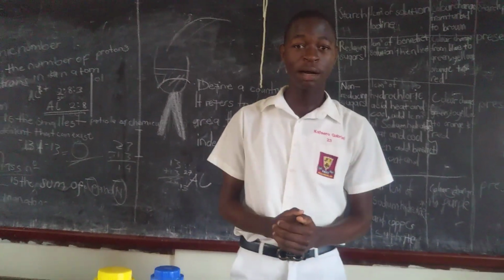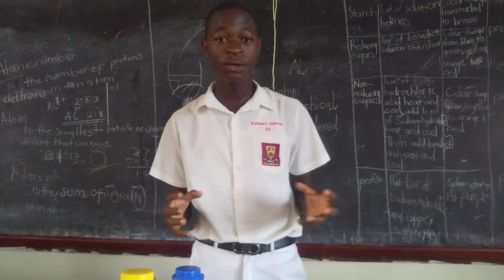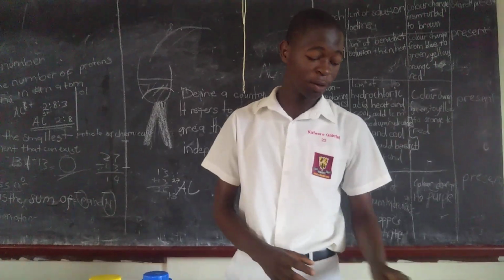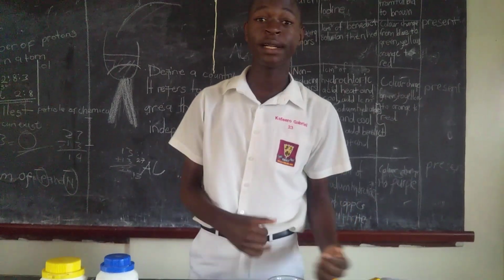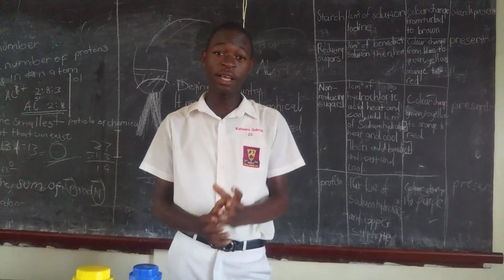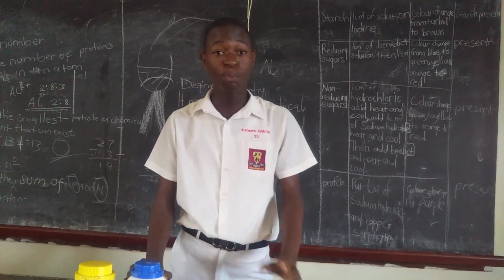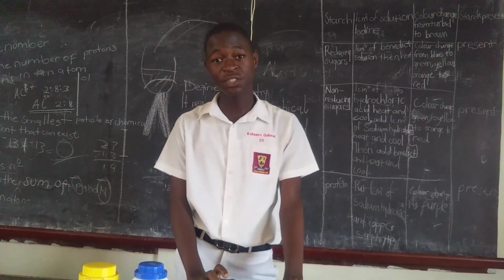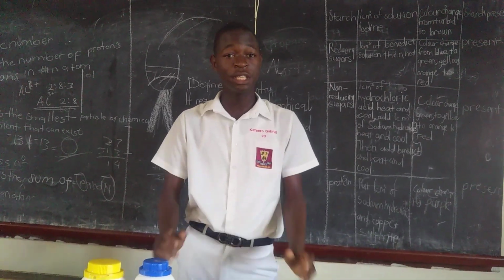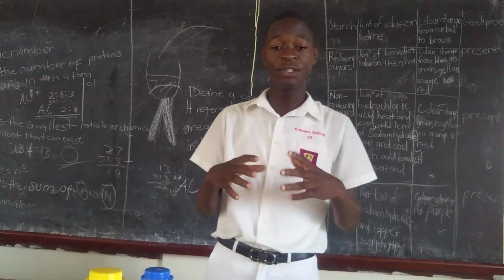So today I'm here to present to you a simple chemistry practical. Today we're going to talk about the evidence of particles in matter using liquids. So what does it mean? It means to prove that there are really particles of matter in liquids. Are they contained in liquids? That is why I'm here to present to you all that.